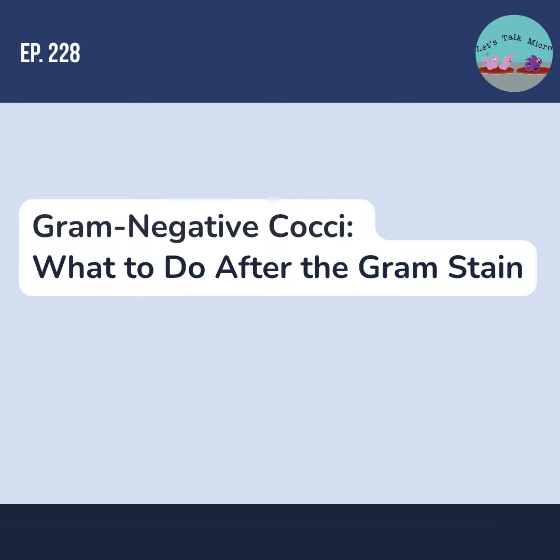And this is a very simple test. You get the disc and you place it on a slide, then apply your colonies using a wooden stick. A positive result is a blue color developed within 2 minutes. A negative result is no color change. Keep in mind that you have to make sure that what you place on the disc is a gram-negative cocci.